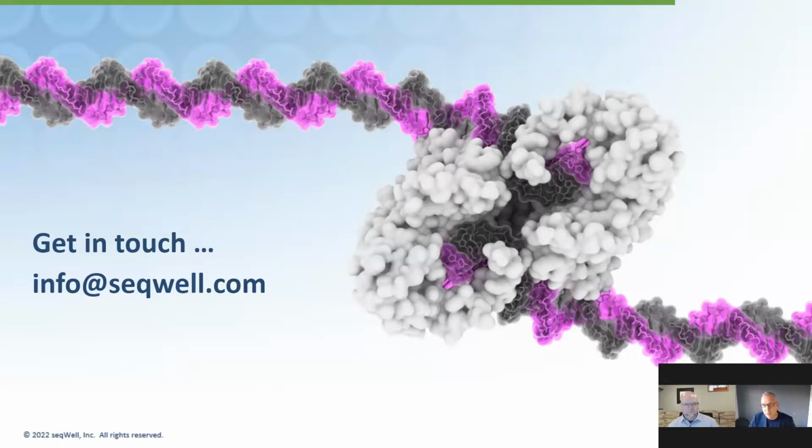Yeah, great question. There's a lot of history here where TN5 transposase has already really been shown to be a great tool for this. Historically, methods such as SMART-seq2 and related high throughput RNA-seq assays have heavily relied on this enzyme.